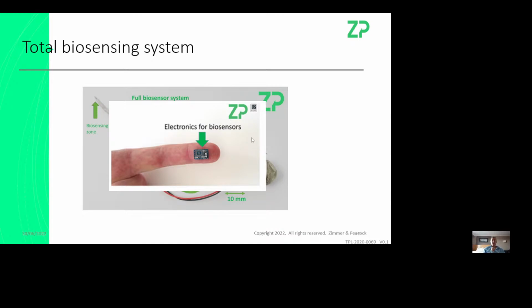So the SeedStat seems to be the most supported open source potentiostat out there, and you can try it. You can compare it next to our ISC OEM solution, but I'm also showing that even our ISC OEM solution is actually quite large, and you should be able to make it much smaller, the size of a fingertip.